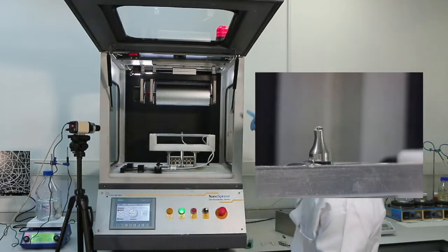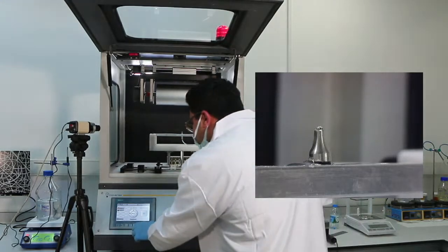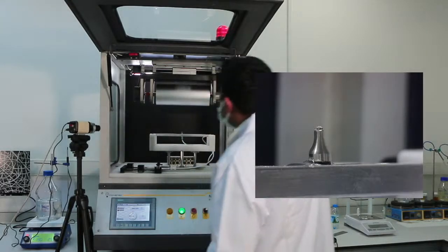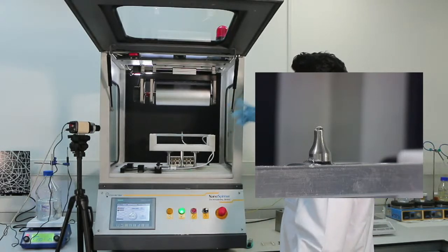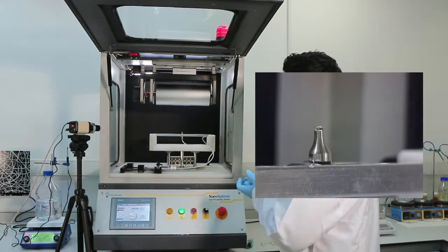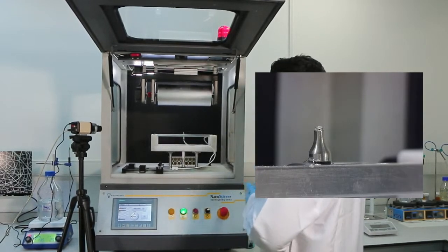I'm not sure if you can see, but nanofibers are being formed. So let's turn to the collector. Let's activate the rotation, and now, as nanofibers are being deposited onto the drum, it's rotating, allowing more aligned patterns. Now it's aligning and the process is continuing.